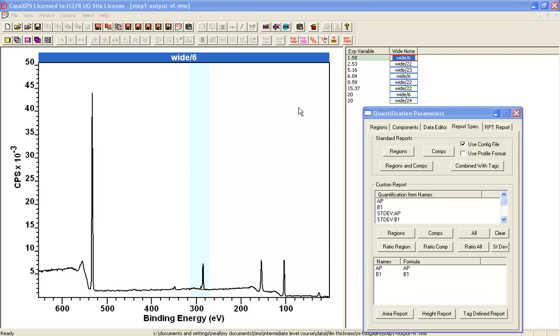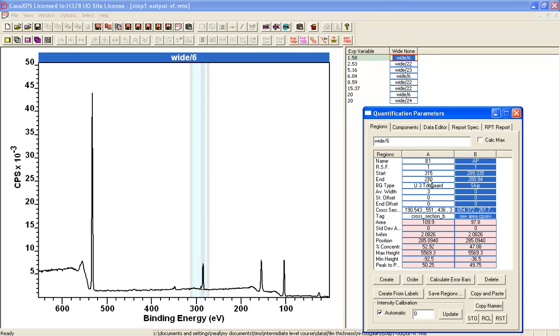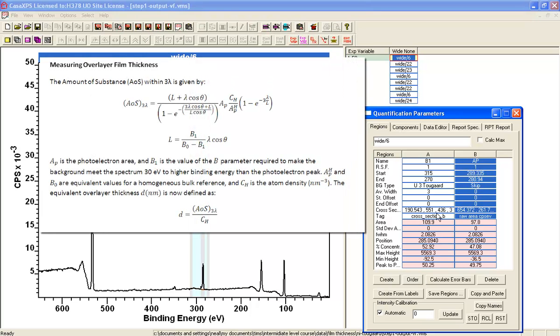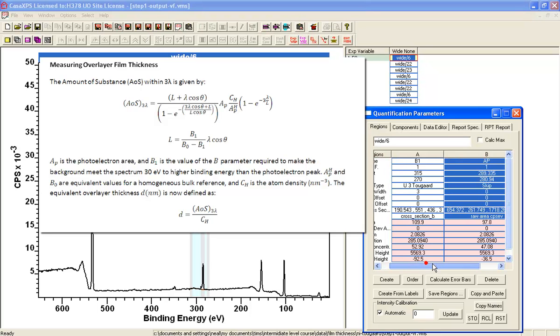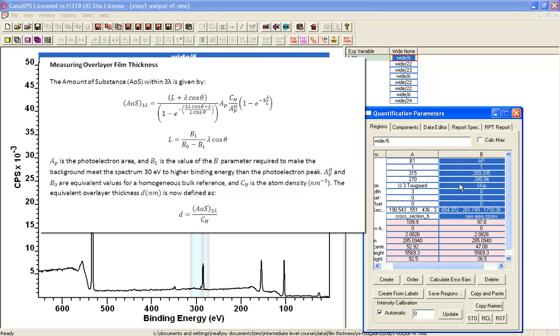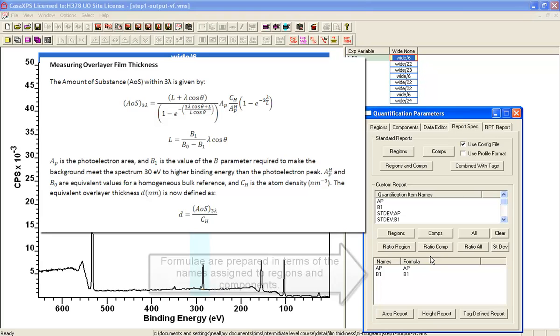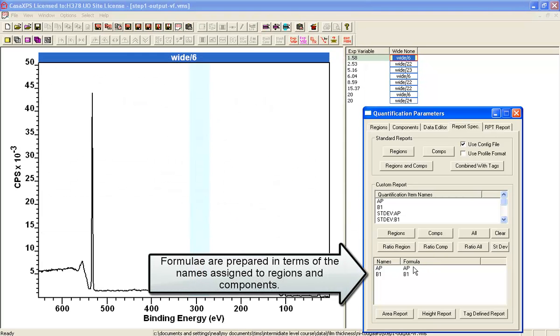The file as prepared from step 1 includes two regions defined on these spectra that are set up to extract the B1 parameter from the cross section and the raw peak area from the second region that has a skip background type. These are going to be used to create a formula that we can enter into this table here to calculate the film thickness.